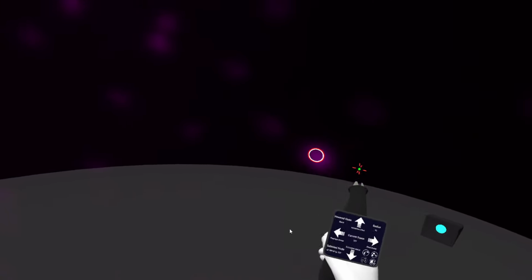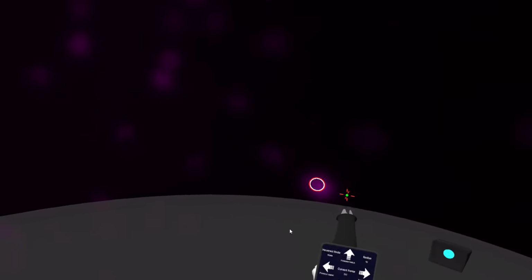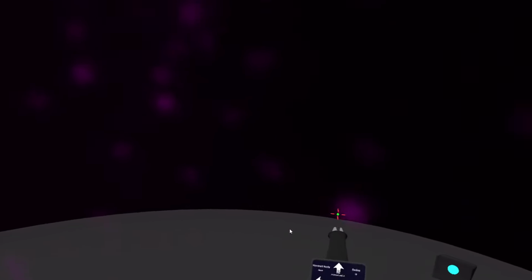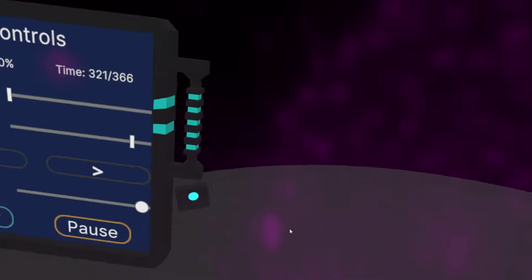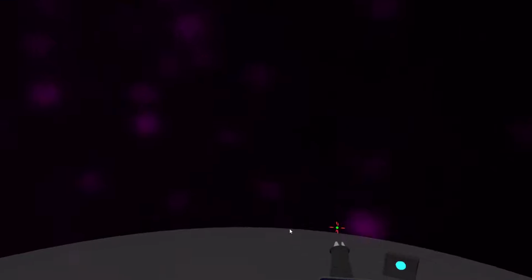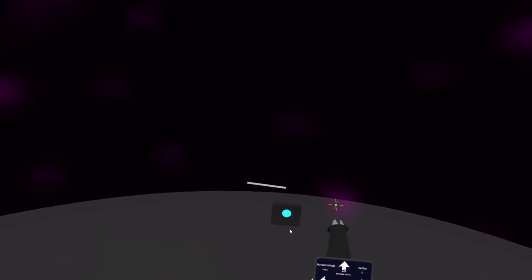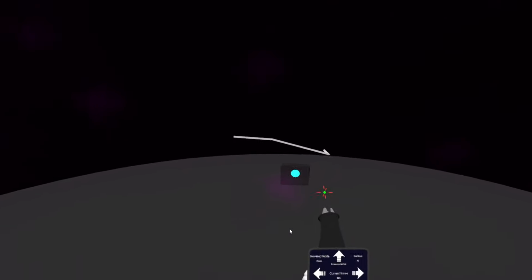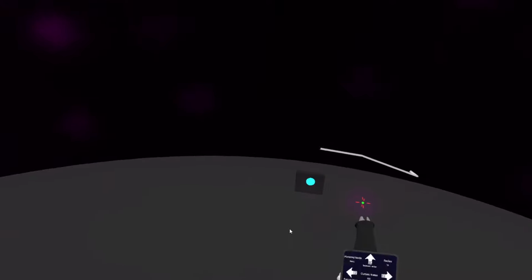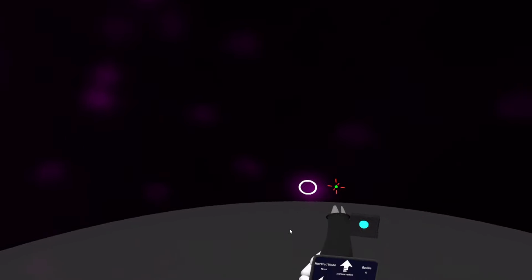And I can go forward and backward in time by using the right and left arrow of the joystick. And so if I go forward in time, I can then click and add an annotation. But a little bit better is, what if we could do this sort of automatically?